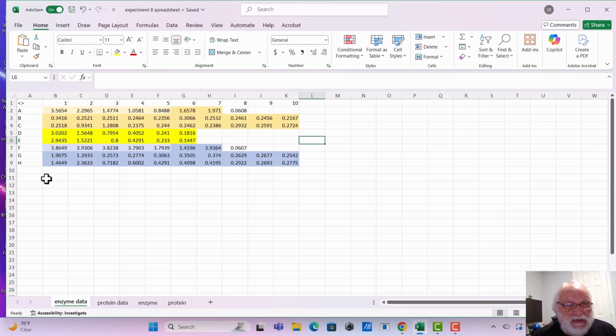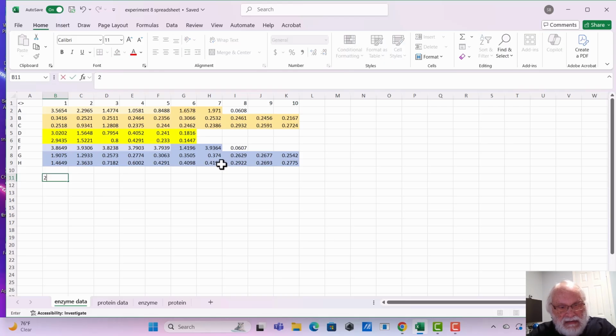So what we need to do is see what the standard curve looks like, and that's what I always do first. The top fraction was 250 micromolar, and from there we did a twofold serial dilution. So let's put equals this value divided by 2, and we have that.